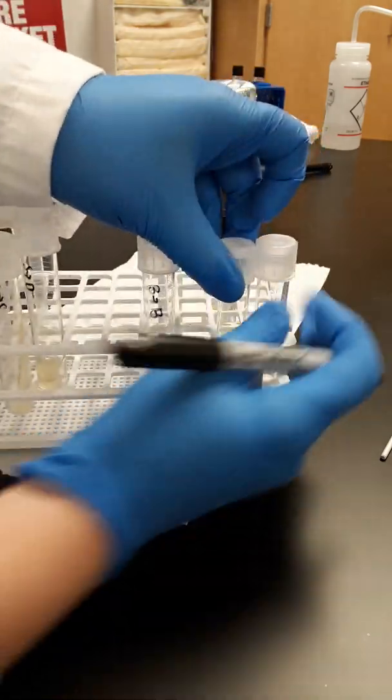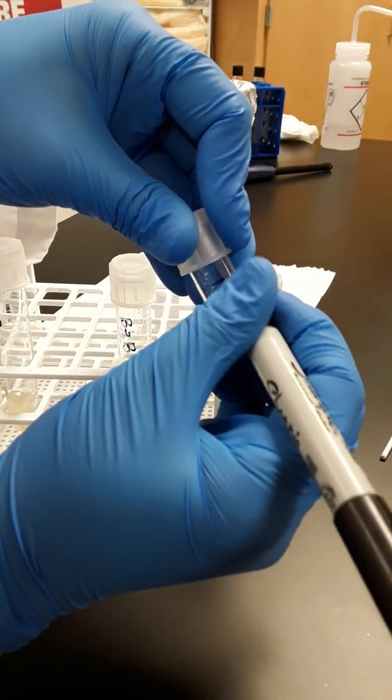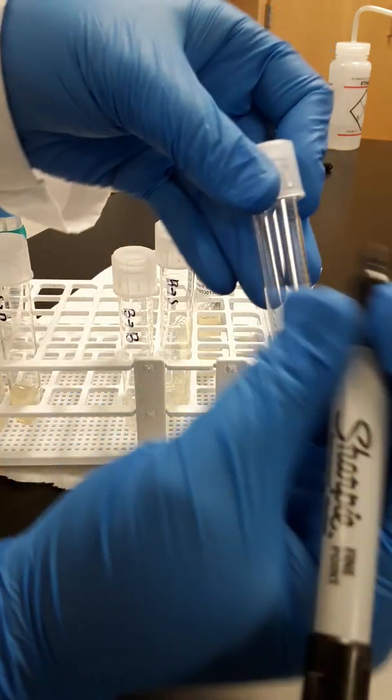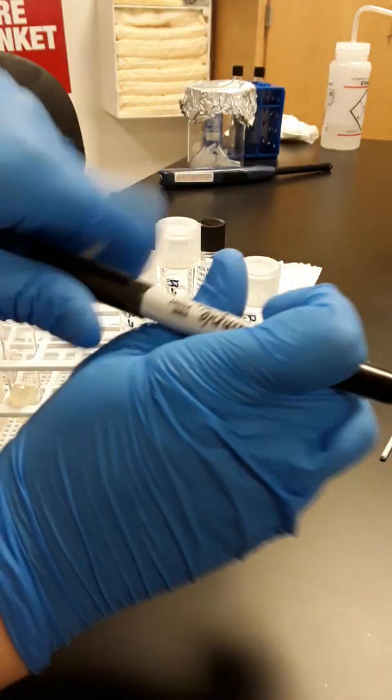This one is going to be broth to slant, because we're starting with a broth, and this particular medium is a slant. And then this one's a deep. We're starting with a broth, we're going to end up with, and we're going to inoculate that into a deep tube.